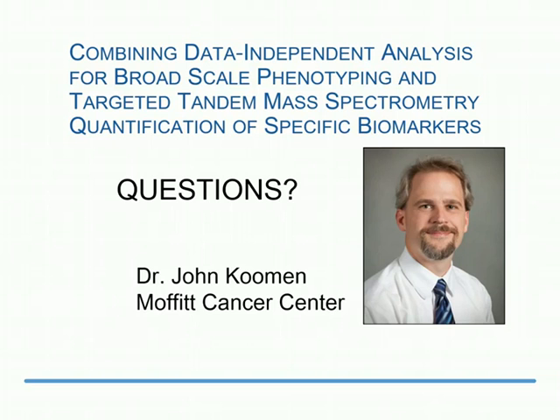And going back to that slide where we looked at the individual samplings from the targeted MS2, that gives us a guideline of how well we'd like to be able to sample the peaks. And when we have our DIA strategy, we randomly acquire in the area that we want, which would be at the apex of the peak, and sometimes we randomly acquire either too early or too late, and so we miss that. So we're trying to balance our need to get targeted MS-MS data with the ability to get good sampling across every peak that we have.